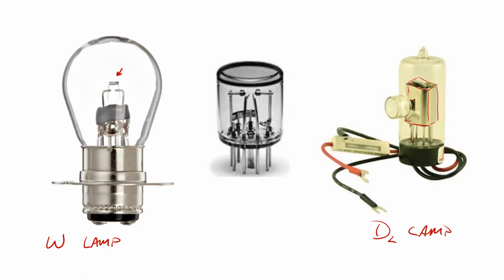And there's a little window in that metal box here. I don't know if you can see it, but there it is. And so all of the light comes out of this quartz. Remember, this window here is quartz, while the rest of that envelope is glass. So it's a funny looking little bulb, but that's how we get our UV light out of that enclosure.